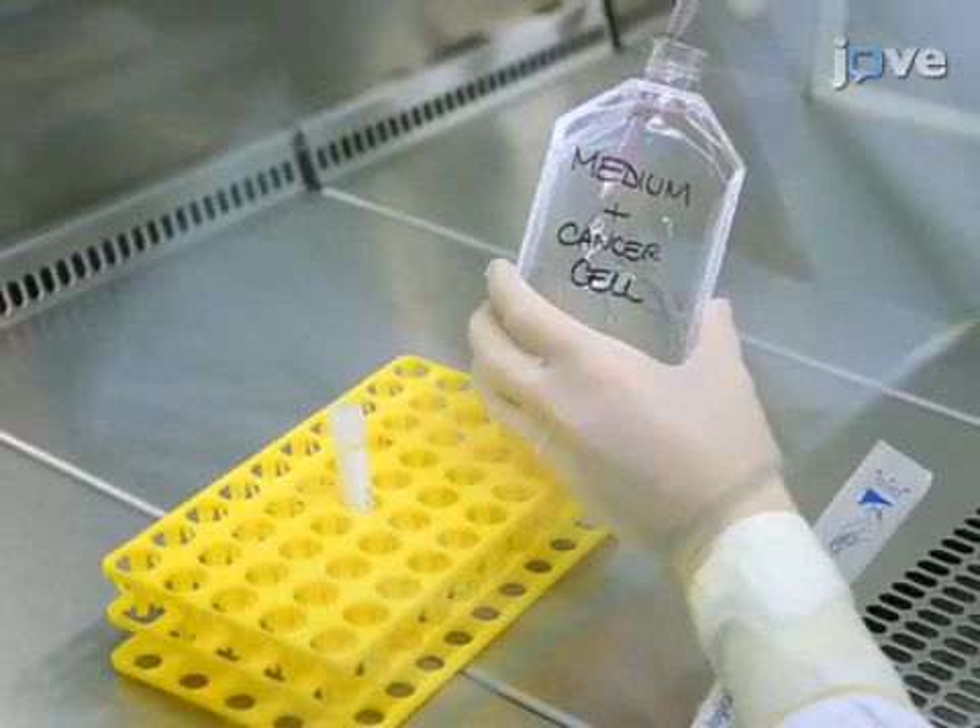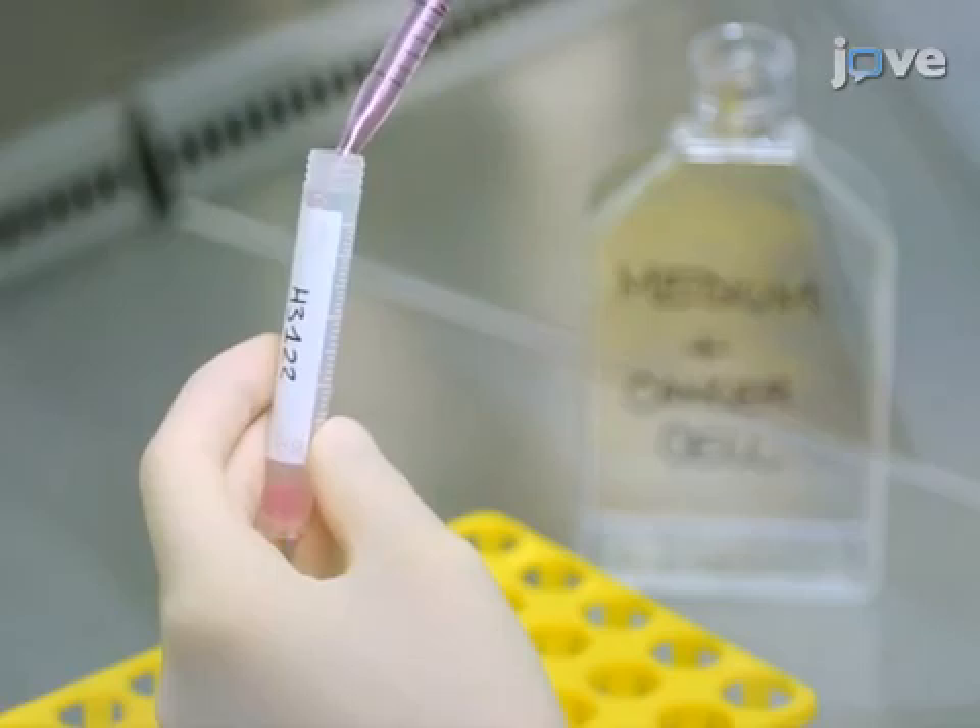To begin the experiment, re-suspend the entire contents of a T75 flask that is at 80% confluence in a 5 milliliter vial using 4 milliliters of complete medium.